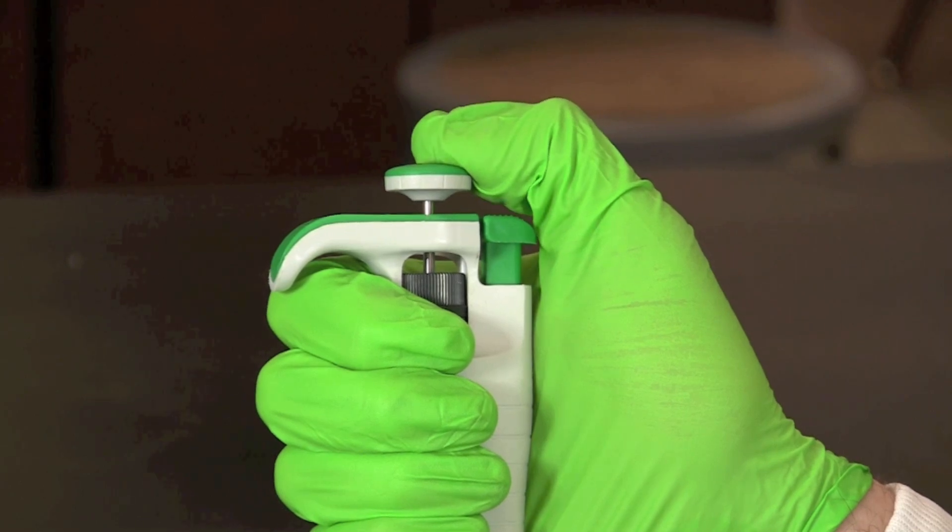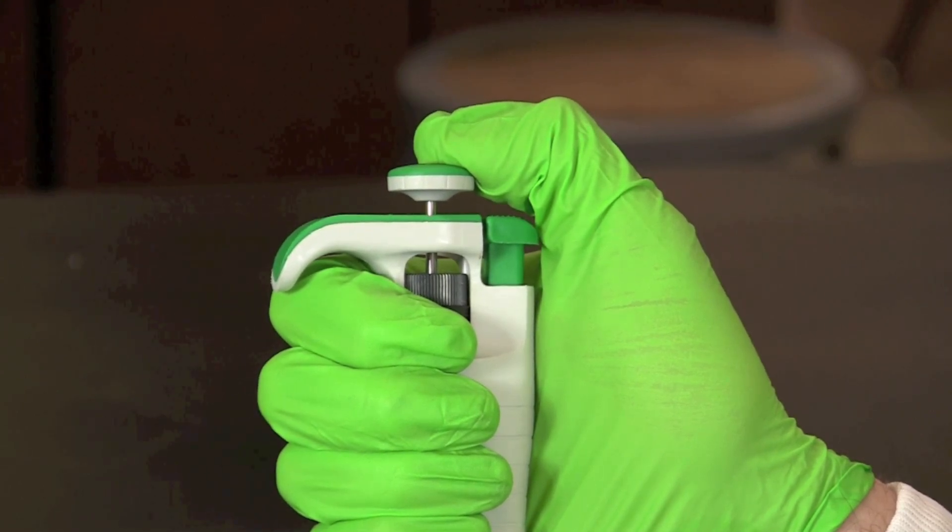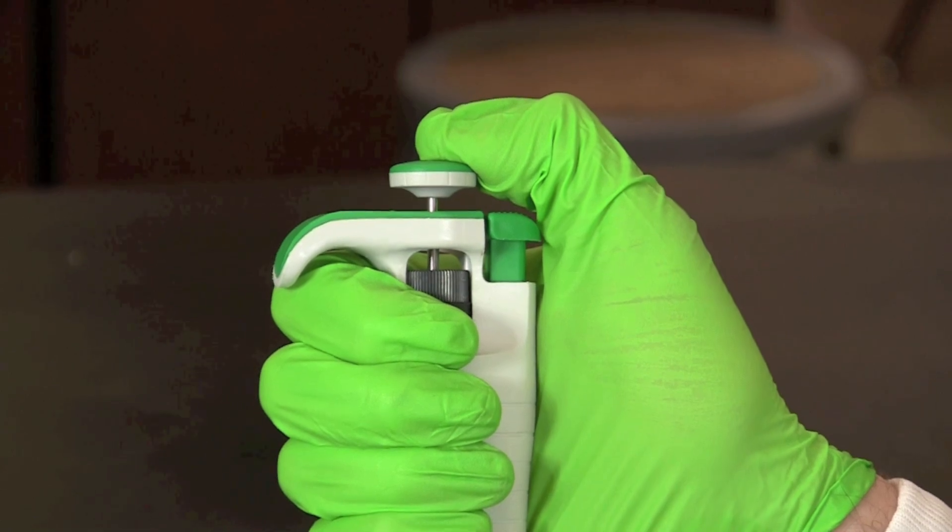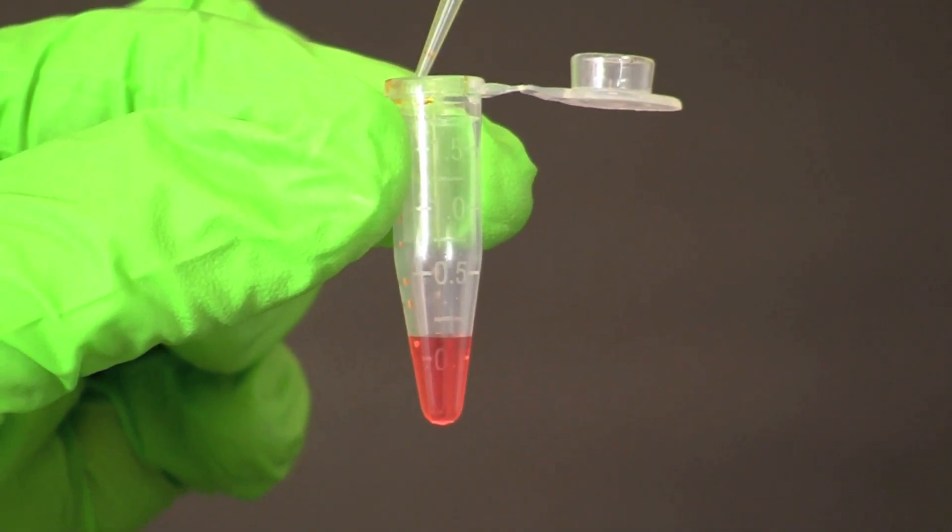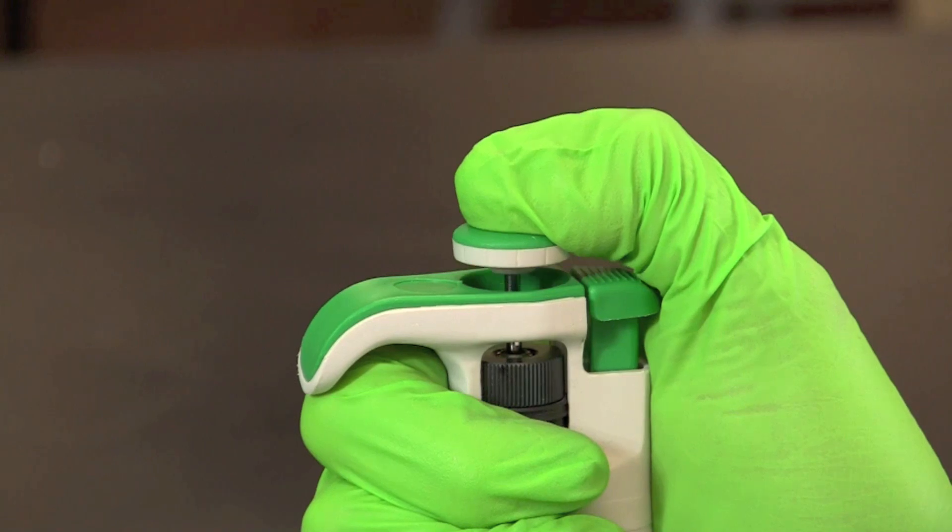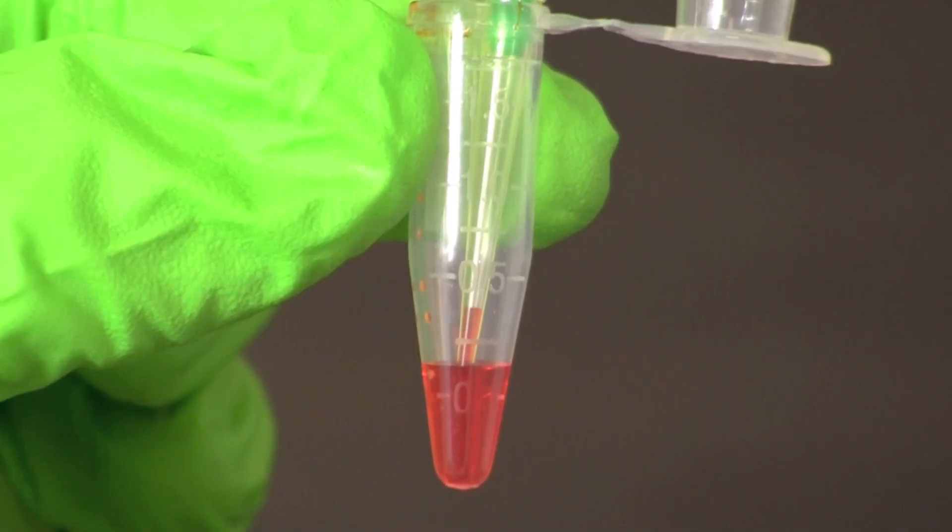To obtain a sample press the plunger button to the first stop and hold it there as you place the pipette tip into the tube holding your sample. Placing the tip near the bottom of the tube, withdraw the sample by slowly releasing the plunger button.